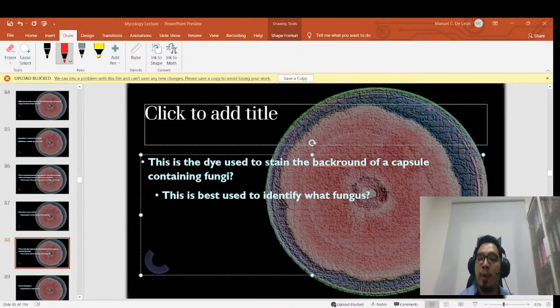This is what you call the starburst appearance. I'll type it on the chat. Starburst appearance. Why do I keep mentioning it? Because Cryptococcus is important because it causes fungal meningitis. Remember that only capsulated organisms are capable of crossing the blood-brain barrier.